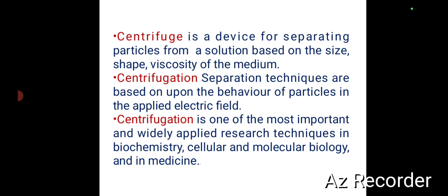A centrifuge is a device for separating particles from a solution based on the size, shape, and viscosity of the medium. Based on this, we can separate it. Next, centrifugation is a separation technique based upon the behavior of particles in an applied field. It is also one of the most important and widely applied research techniques in biochemistry, cellular and molecular biology, and in medicine.